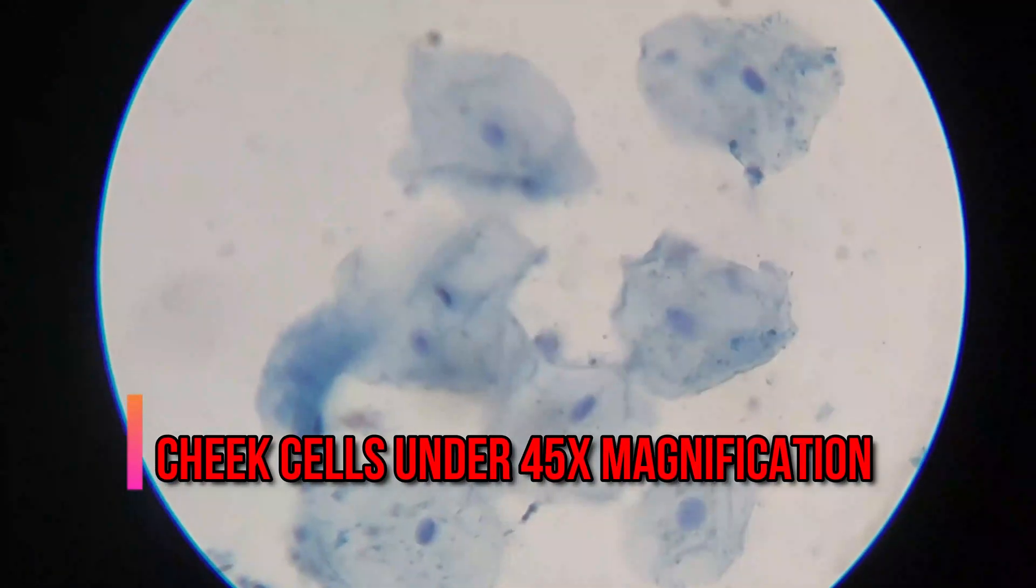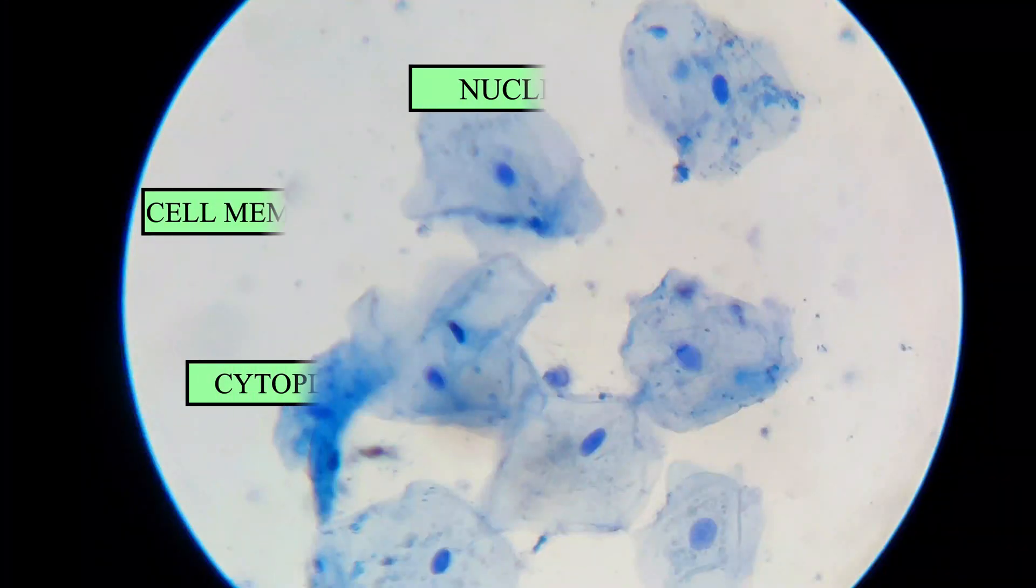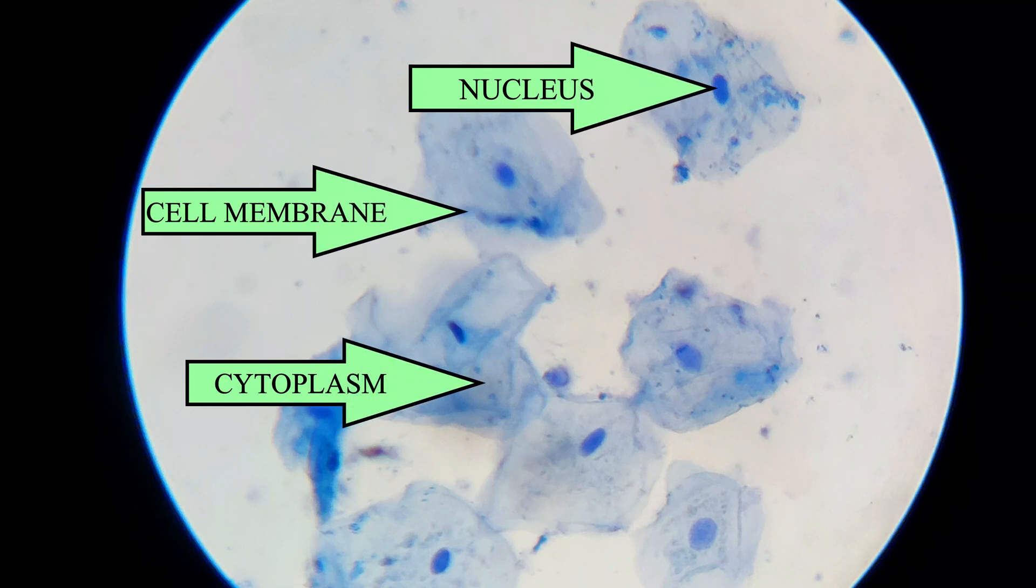After that we will view it under 45x magnification. Here you can see our cheek epithelium cells, nucleus, cell membrane, and cytoplasm that can be easily observed.